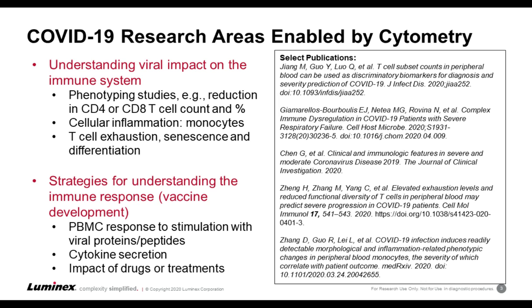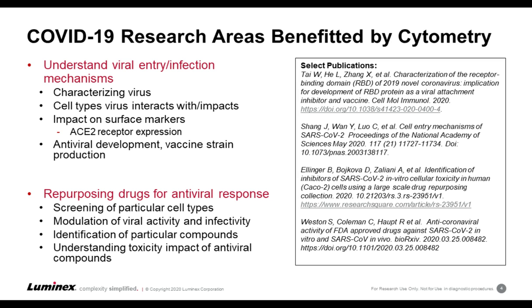Along with impacts on the immune cell populations, people are also studying the immune response mechanisms, and several very interesting publications of late have shown study details where PBMCs are stimulated with viral antigens, and the consequent impact on the immune cells are being evaluated. These kind of studies not only characterize the immune cell response, but also look at secreted cytokines, and intracellular cytokine measurements are also being performed. And these kind of approaches are, again, very important in vaccine development strategies as well as drug development approaches.